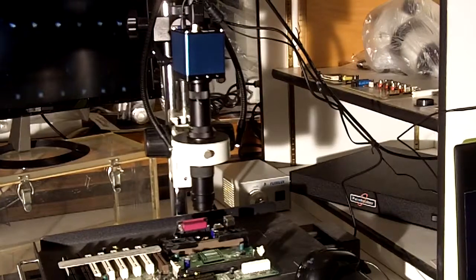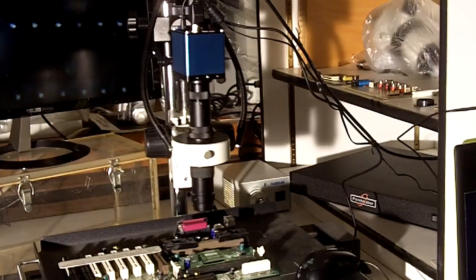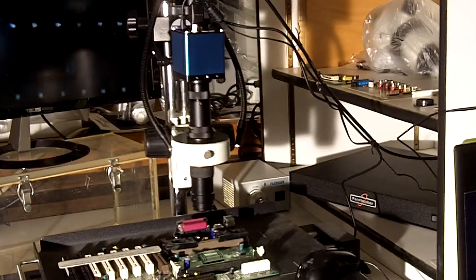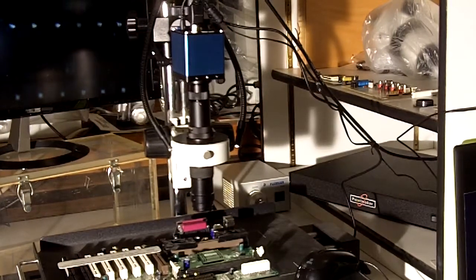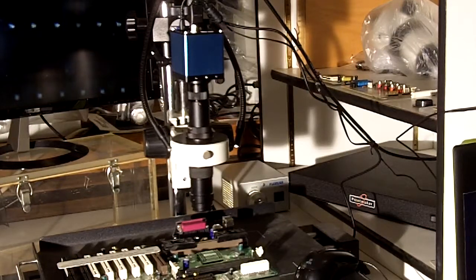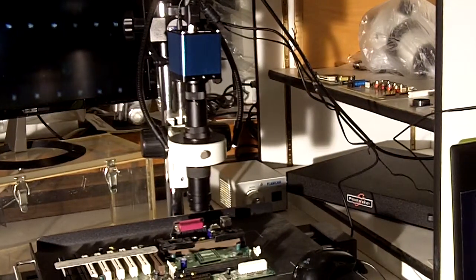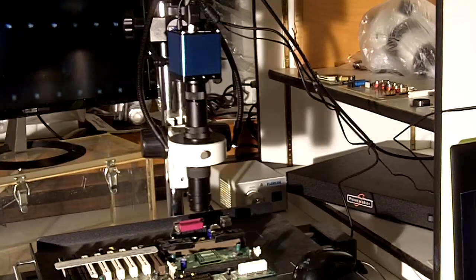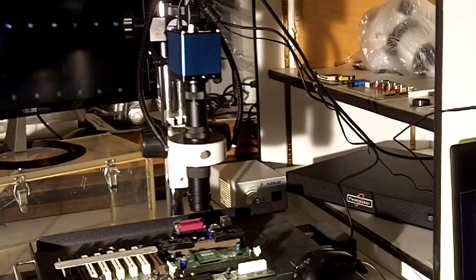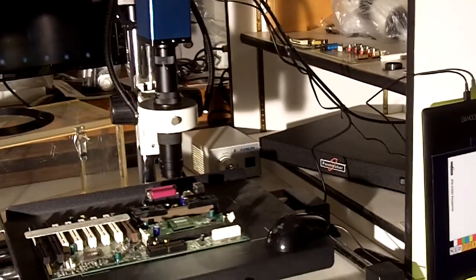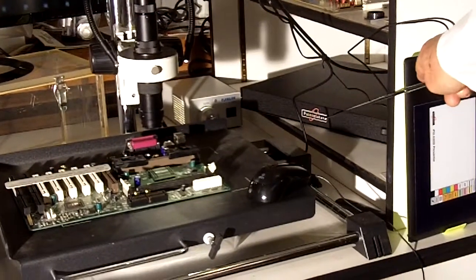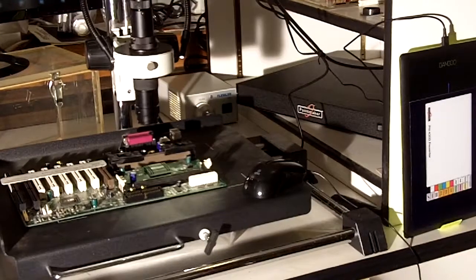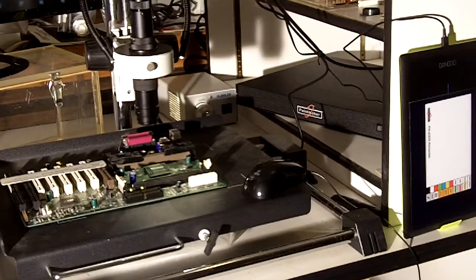Now I think where this gets interesting is using high definition real time as a teaching tool. And in order to do that we use this black box down here that you see on the shelf.